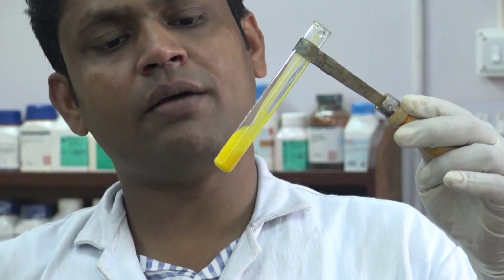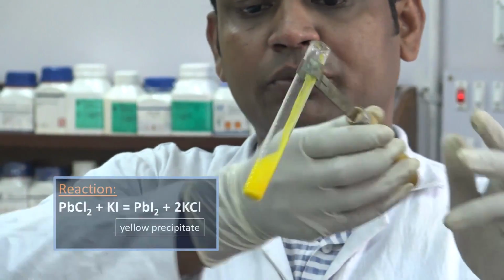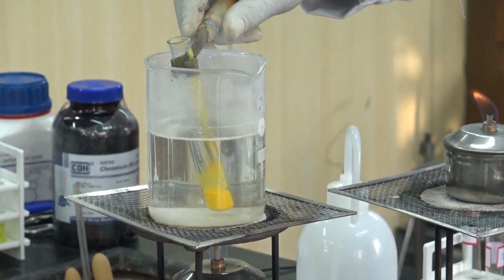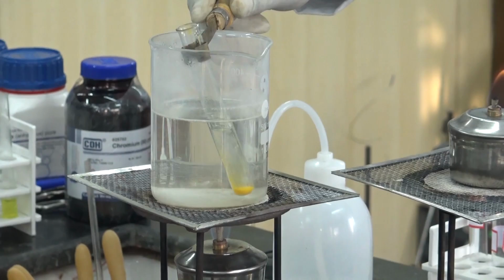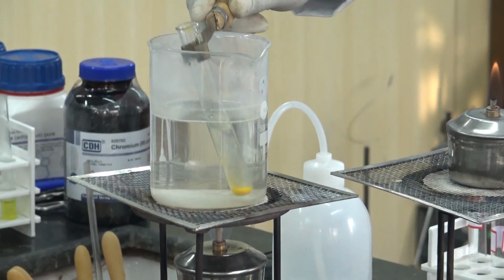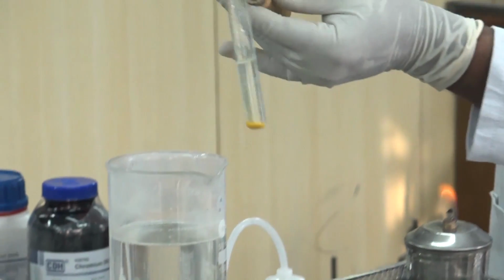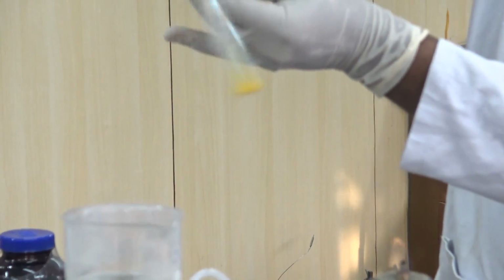This confirms the presence of lead ion, and this precipitate is soluble in hot water. That is, when we heat this solution on a water bath, we can see that the precipitate is dissolved in hot water.